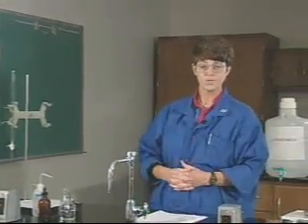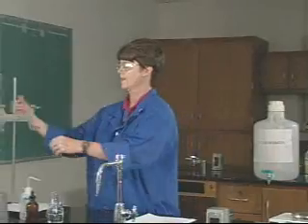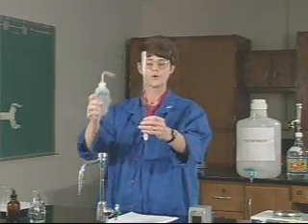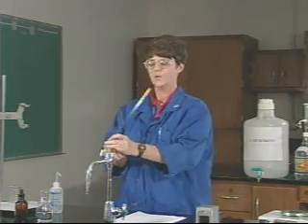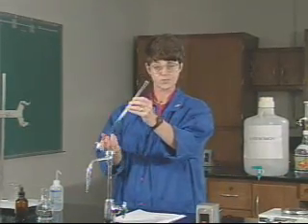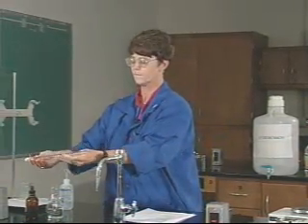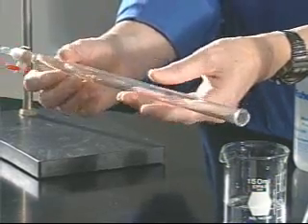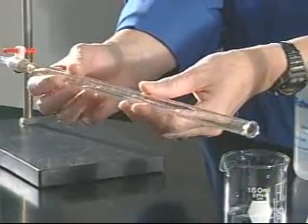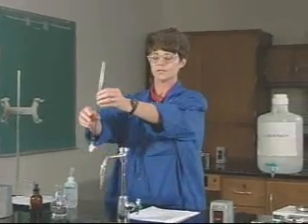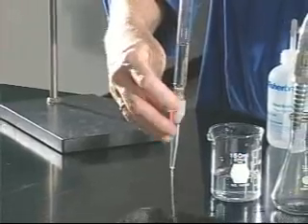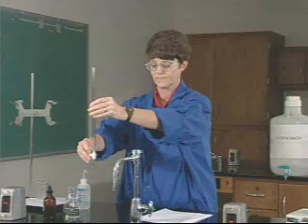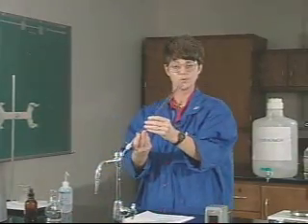To begin the experiment, the first thing you need to do is make sure that the burette is clean and rinsed. First, add about 5 milliliters of water to the burette. When you rinse a burette, you don't need to fill it all the way to the top. Just put some material in there, turn the burette on its side, and gently rotate it so the liquid contacts all the surfaces. Save a little bit of rinse to also rinse the lower part, then open the stopcock and allow the rest of the rinse to flow through. This first rinse is with distilled water.